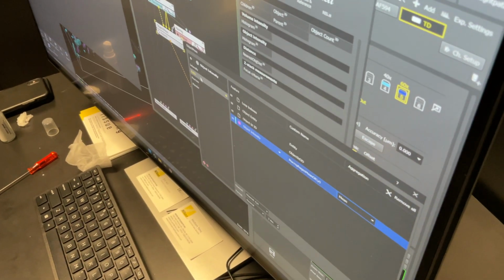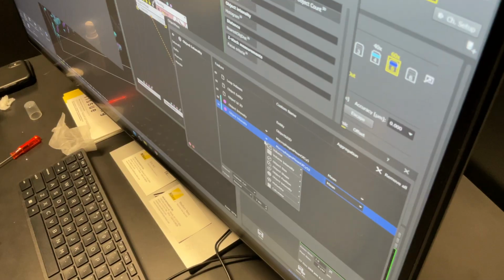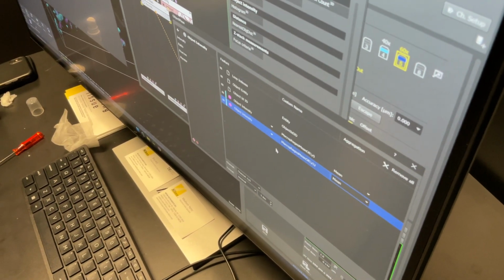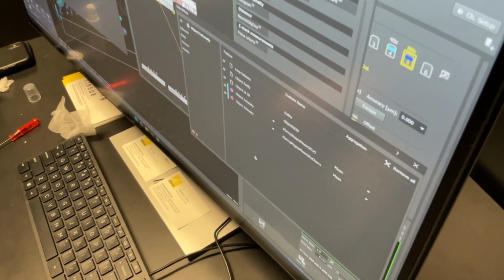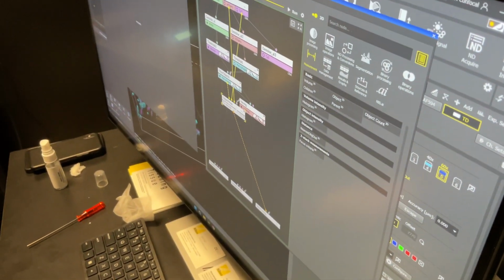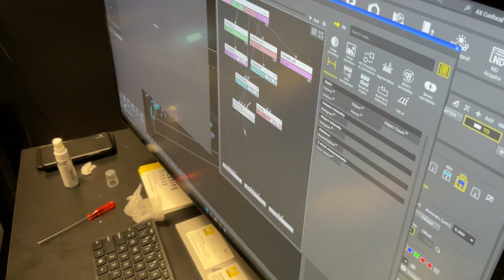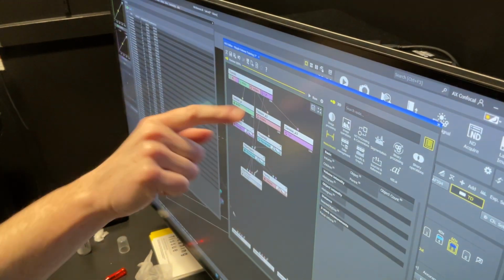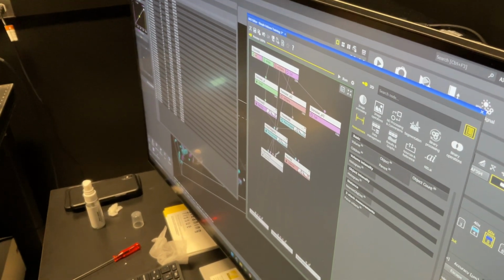Yeah, sci-fi. That's good. And then I could add another one. Will it change both the intensity, or change the channel? Oh, the channel. There you go. Okay, there it is. And then I can X out, close that, and toggle. We're not seeing any data just because that's not toggled. And then it'll output. Okay, awesome. I just wanted the basic measurement.